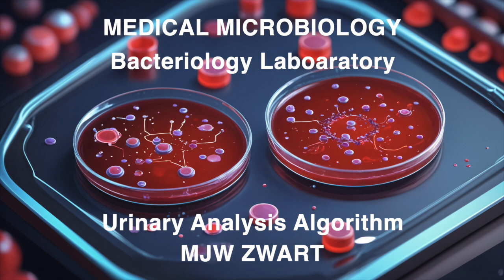So we've talked about using the Q-score and gram stain to guide our culture process. And it sounds incredibly efficient. It is. But what happens once we do get growth on our plates? Good question. How does this document walk us through identification and testing? That's where it gets even more interesting.